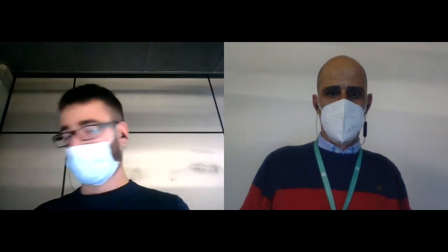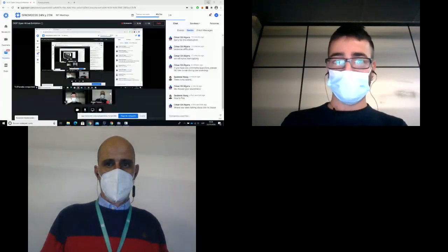We observed it with 40x. Here it is the sample. I had saved some elemental images from another portion. The sample is very big, so I couldn't find the most significant, let's say, portion. But I had saved some elemental images.